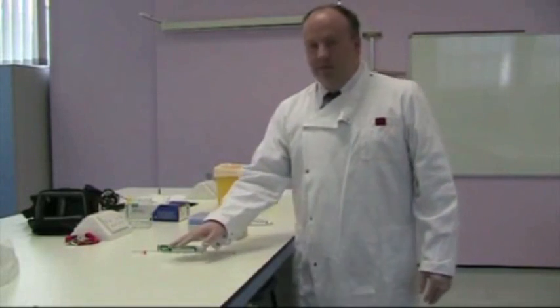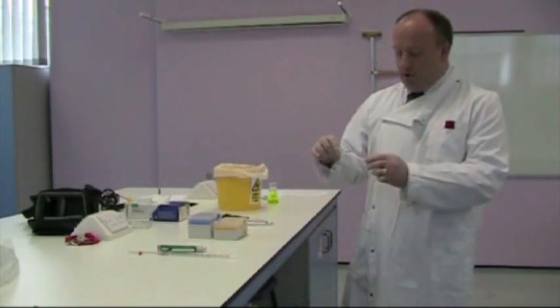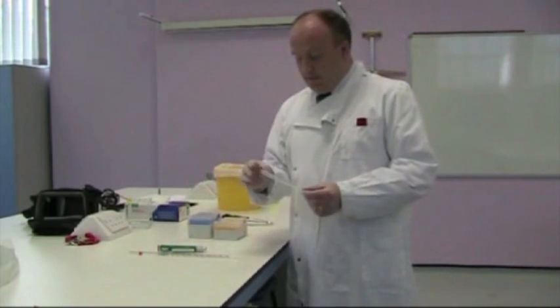So in this session we're going to look at dispensing liquids and there are three different types of pipettes that you'll see in the laboratory and they each increase in sensitivity and accuracy.